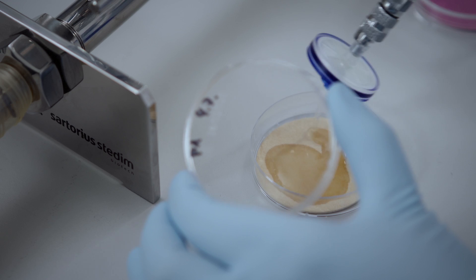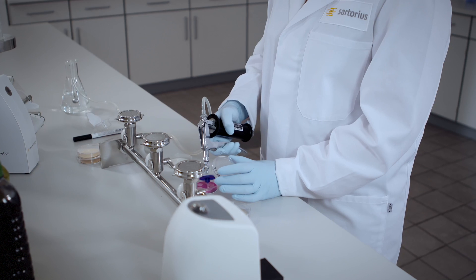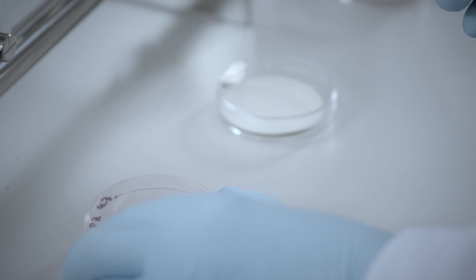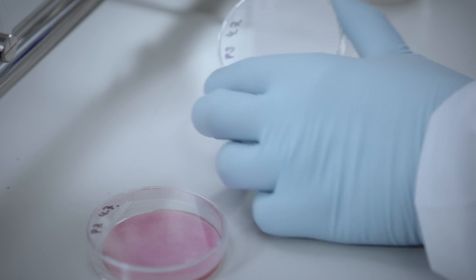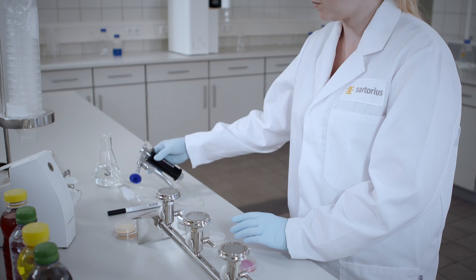Moistening the dehydrated pads with 3ml of sterile water makes them immediately ready to use. The level of moisture is optimal when an excess of water surrounding the pad is visible. Each type of nutrient pad set is delivered with the best suited membrane filter for reliable and reproducible growth promotion results.